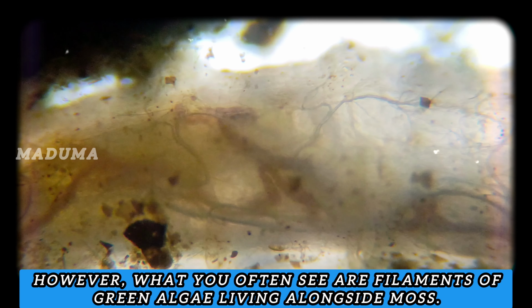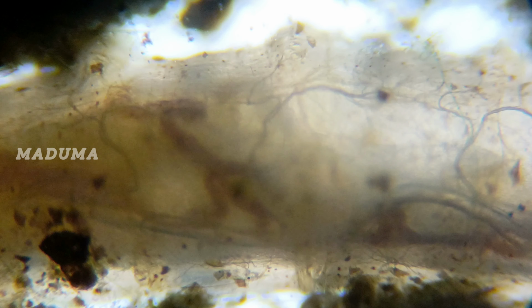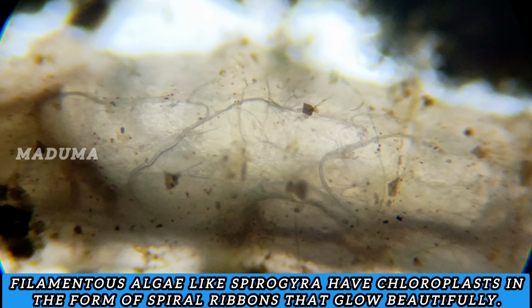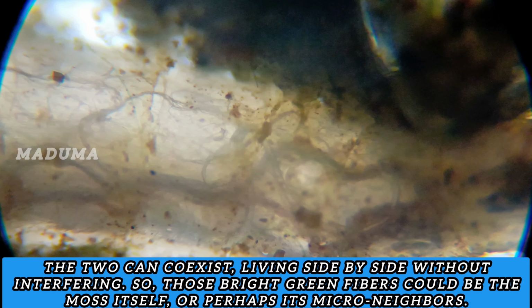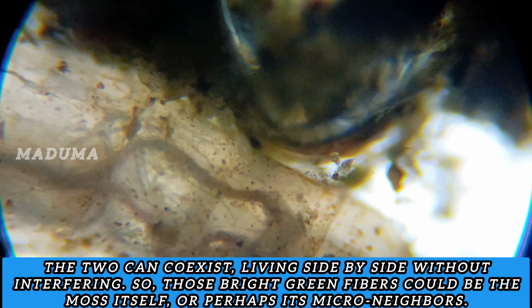However, what you often see are filaments of green algae living alongside moss. Filamentous algae, like Spirogyra, have chloroplasts in the form of spiral ribbons that glow beautifully. The two can coexist, living side by side without interfering. So, those bright green fibers could be the moss itself, or perhaps its micro-neighbors.